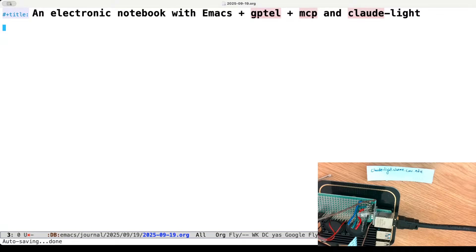Emacs is a text editor and gptel is an Emacs Lisp interface to many LLMs — you can use OpenAI models, Claude, Gemini, local models, there are a whole lot of them. It has an integration with MCP, and you can define tools and create presets with specialized system prompts and tool access. There's an MCP server I've shown before with Claude Desktop, and today we're going to explore how to use it here in Emacs.